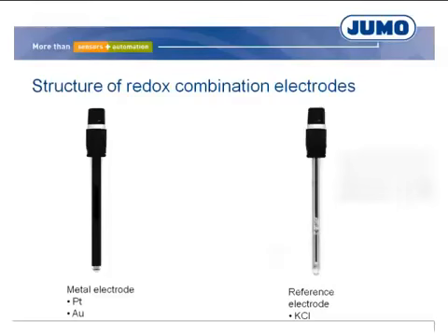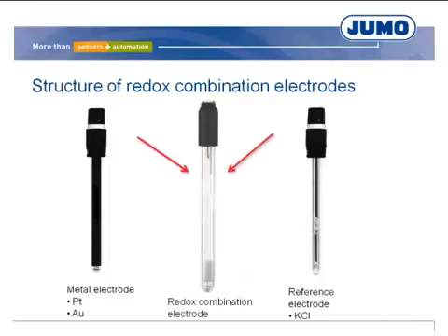The diaphragm in the shaft wall creates the conductive connection between the reference electrolyte and the measurement medium. The ceramic diaphragm shown is suitable for clean measurement media. As a rule, the sensor consists of a redox combination electrode, as opposed to two electrodes.